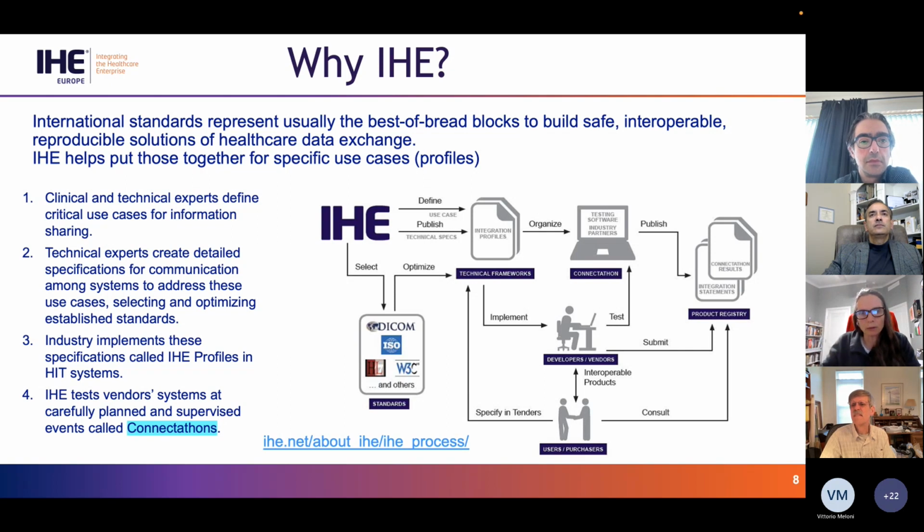And what you are about to do is go to the Connectathon, which is one of the major advantages of using IHE profiles, because you can test them against a validation, but also do system-to-system integration tests at the Connectathon.